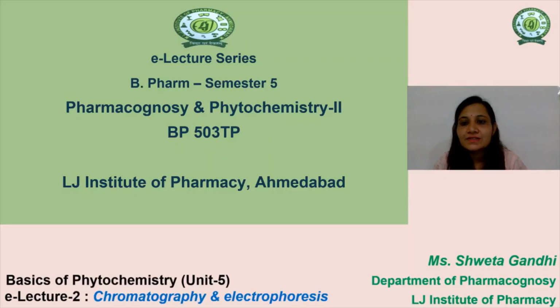Dear students, in previous e-lecture series, I have already explained to you the modern methods of extraction used in identification, purification and separation of crude drugs, Unit 5. In this lecture 2, we will study the same unit with a different topic: modern techniques used for isolation and purification of crude drug, which includes chromatographic techniques.